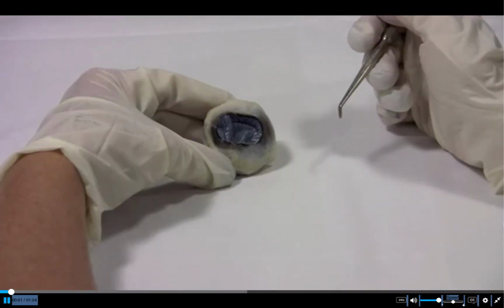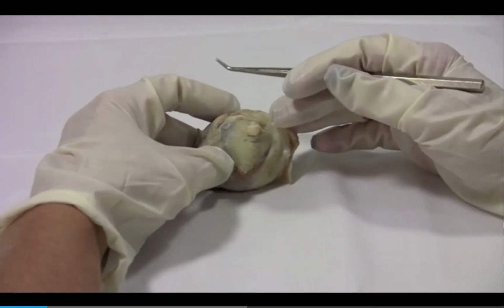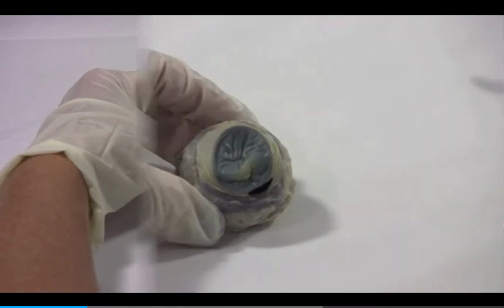The eyeball is divided into two segments: the anterior segment in front of the lens and the posterior segment behind the lens. The anterior segment has two subdivisions: the anterior chamber and the posterior chamber.